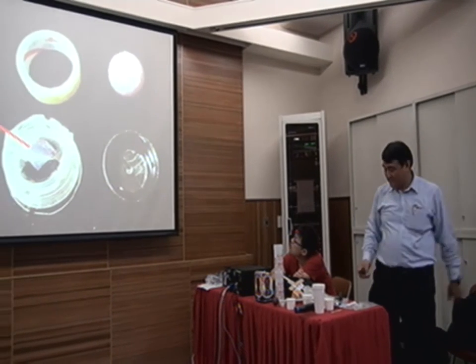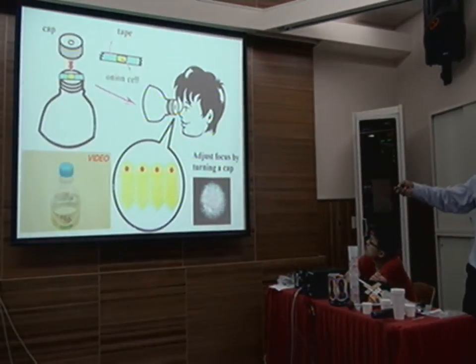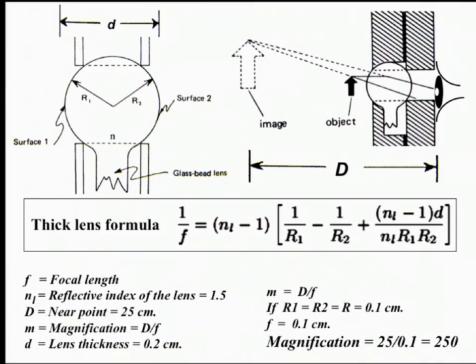Instead of doing that calculation — it's too complicated, let's just skip this — this is how we can measure the magnification of this one. It's about 250x. That's high enough to see the red blood cell and many things at the high school level.